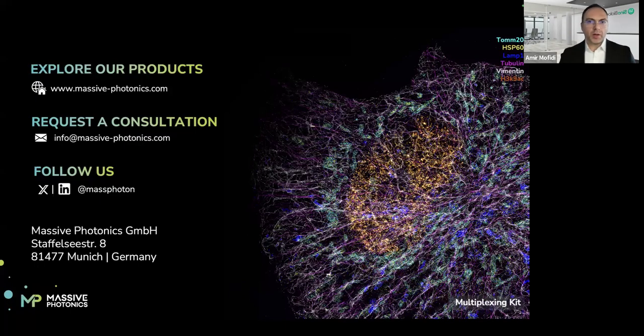And regarding biomolecules imaging, is it possible to use DNA paint for any other kind of biomolecules than proteins? Yes. So traditionally, DNA paint has been done on proteins and on structures called DNA origamis, which are used in DNA nanotechnology.